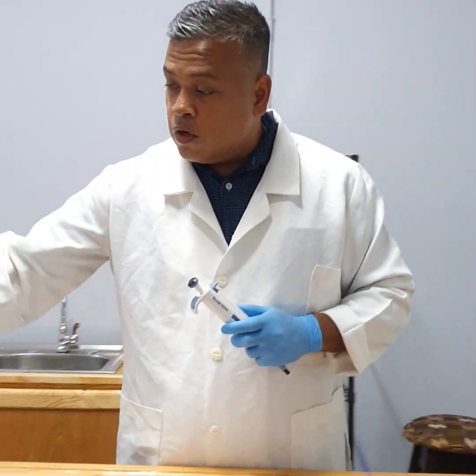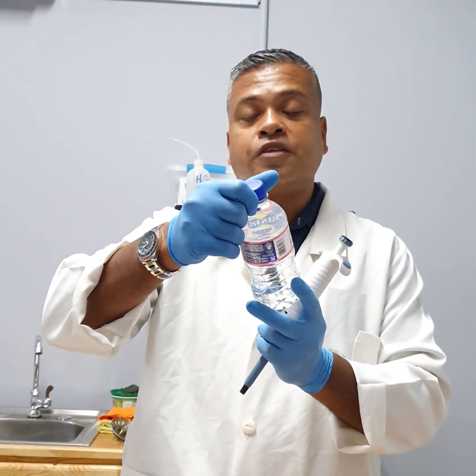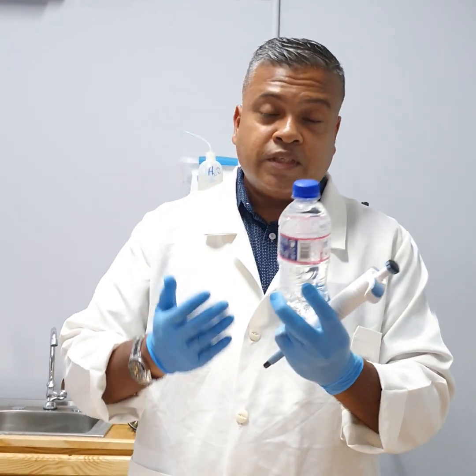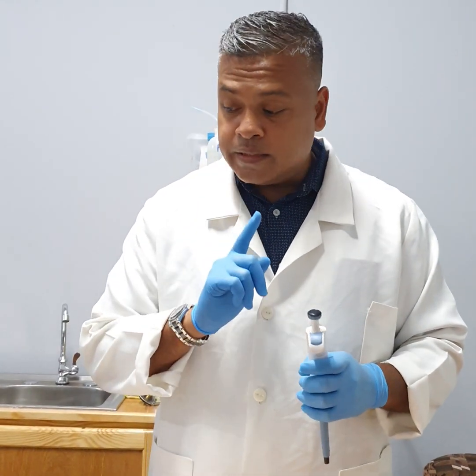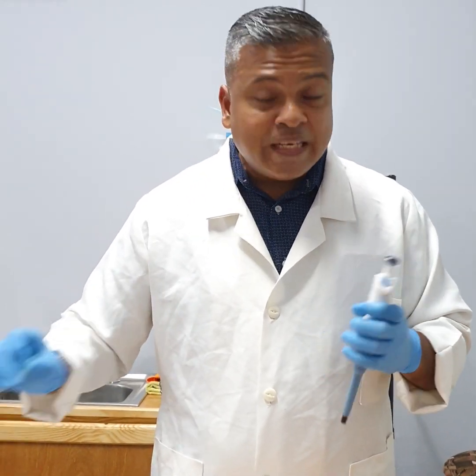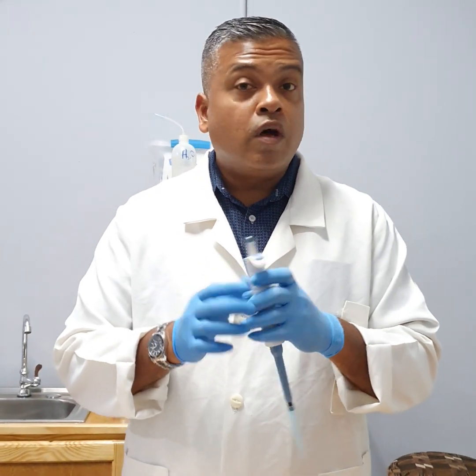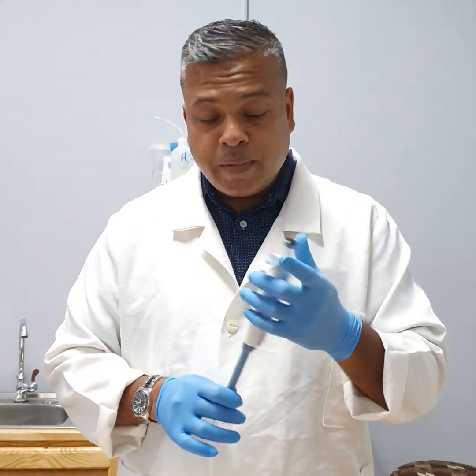What we've got here is a bottle of water. This bottle has 330 mLs, which is just above a quarter liter. So essentially about 3 bottles of this is 1 liter. 1 liter is equivalent to 1000 milliliters. I'm going to show you here what 1 milliliter looks like.